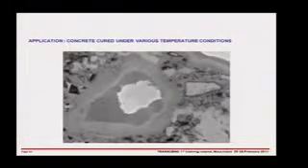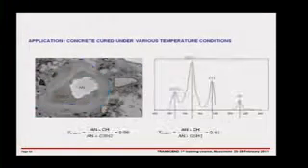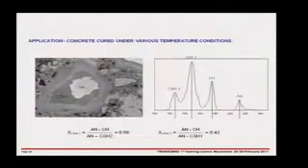And this is this micrograph I showed you earlier from a paste that was cured at 2 different temperatures. This is the histogram. I mean, this is a very kind of obvious case. You see the two different CSHs even produce different peaks like this, and by applying this technique, we can get a precise quantitative measure. What's the relative density of one CSH compared to the other?